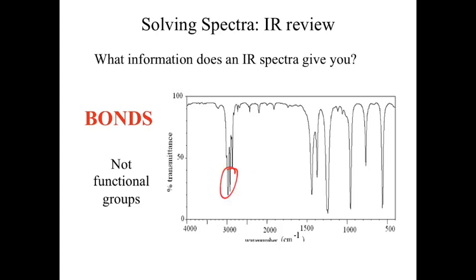Hopefully what you see is we've got some C-H sp3s. The sp3 is in reference to the hybridization of the carbon. And then the rest of that is ultimately all in the fingerprint region. I wouldn't touch that unless I had some more information. So I would ignore that for the moment and hope that maybe I find something later on that can allow me to go back and look at that, because there are some nice peaks there. If not, oh well. So in hopefully less than 10 seconds, you've got something about your structure. Carbons and hydrogens. Kind of boring.